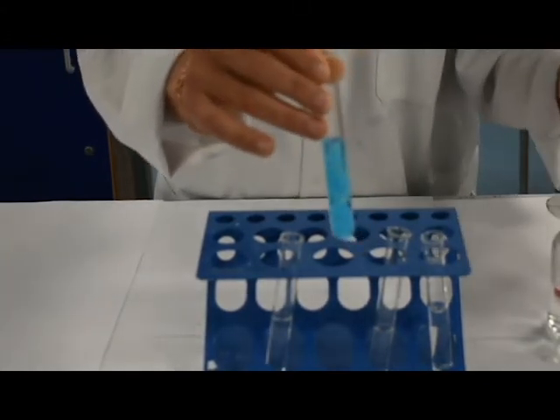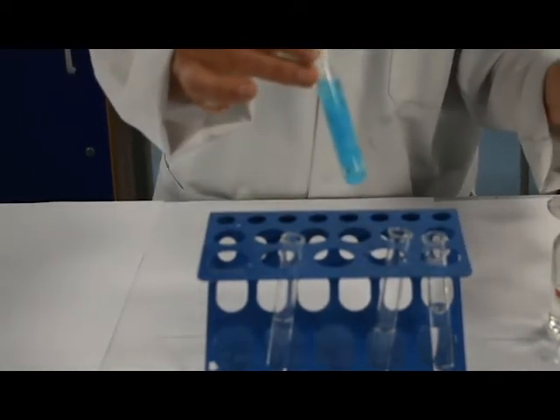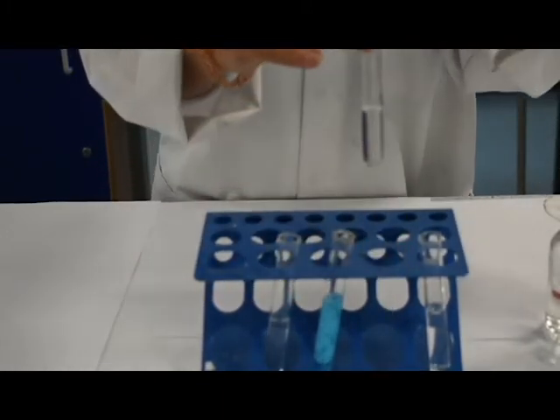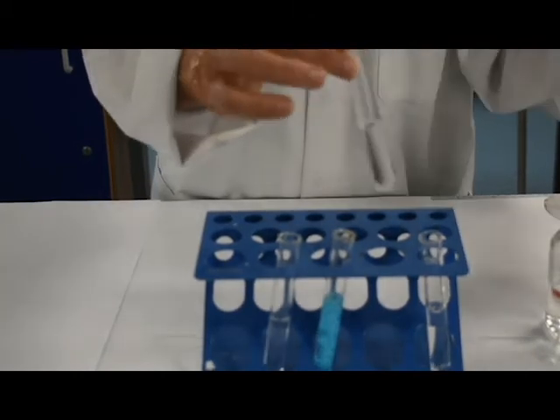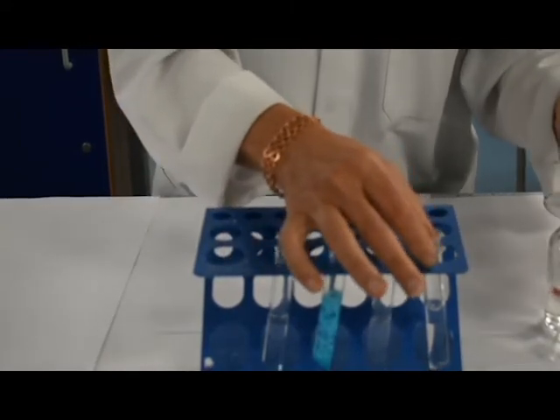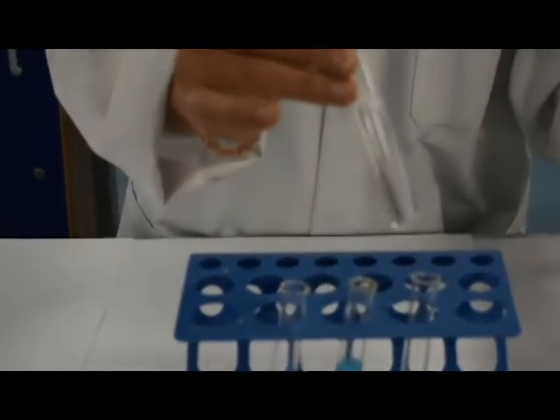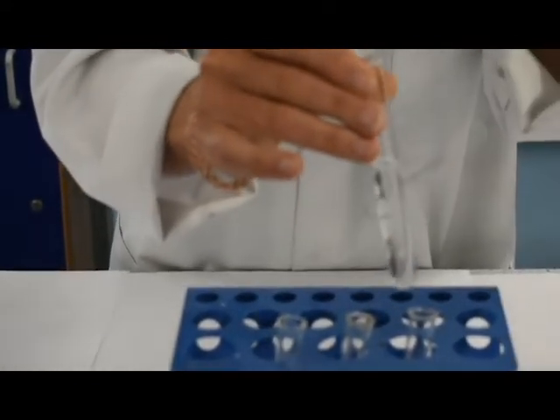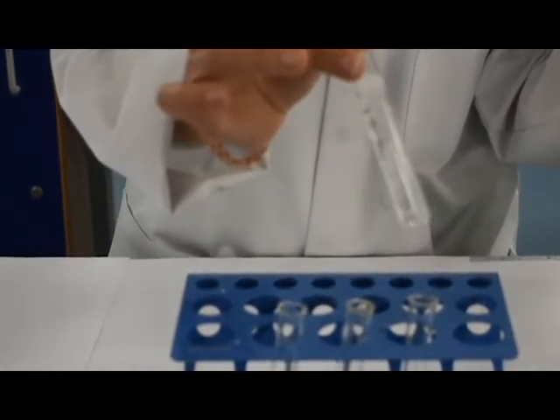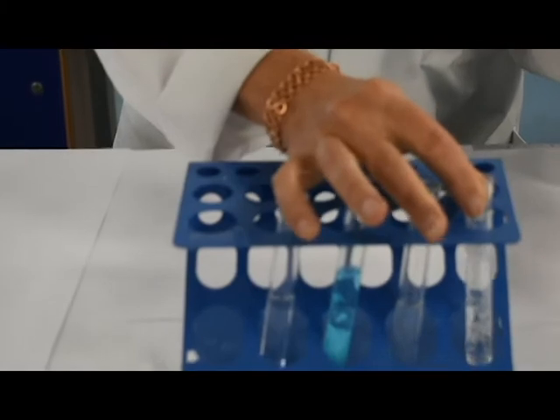Test tube B, just pop a little bit more in there so you can really see what's going on. And that should be a nice clear observation for you. Then we've got test tube C. Again, record those observations. Test tube D. I'm just going to add a little bit more so you can see. Okay, so record those observations.